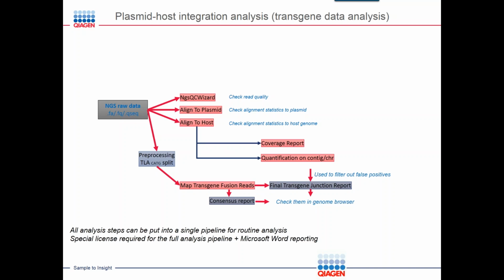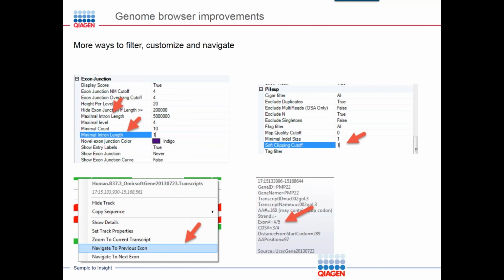And we provided a lot of novel technologies, which essentially are only useful for this analysis, such as circular alignment, cross-species fusion analysis, and consensus analysis based on those unaligned reads. It's really a huge amount of work from the Omicsoft analytic team, and the analysis works so well that we think it's going to completely solve the problem. This one does actually require a special license. So if you're interested, please talk to Matt or the QIAGEN sales team and talk about the capabilities of this particular analysis.